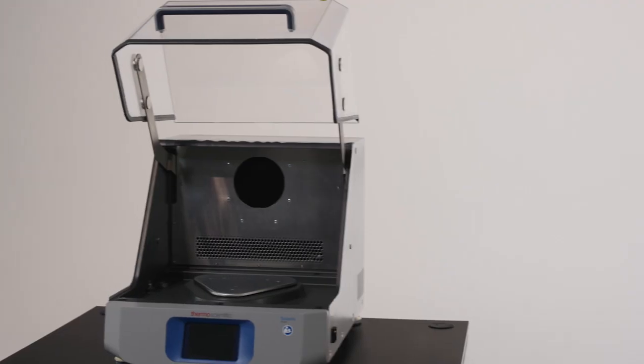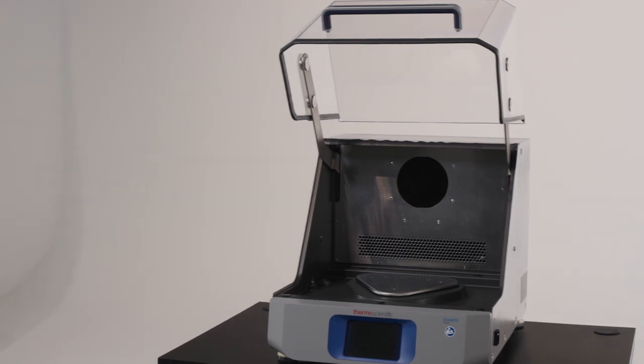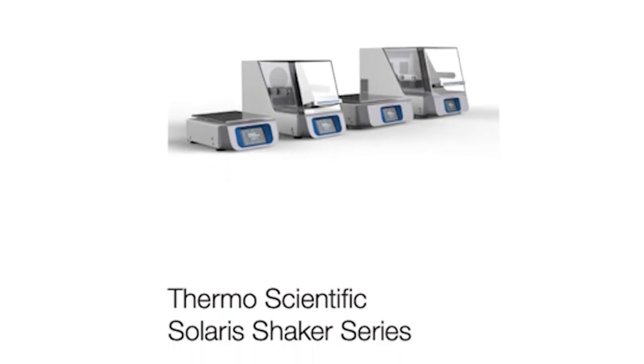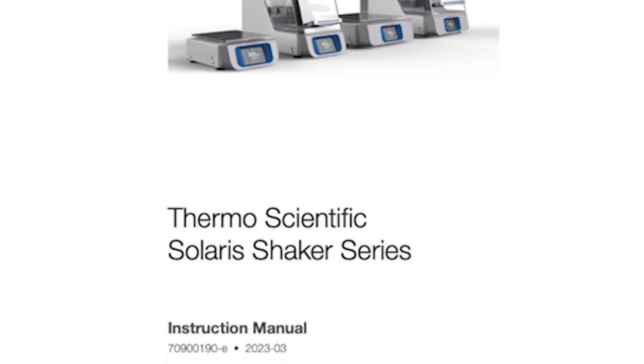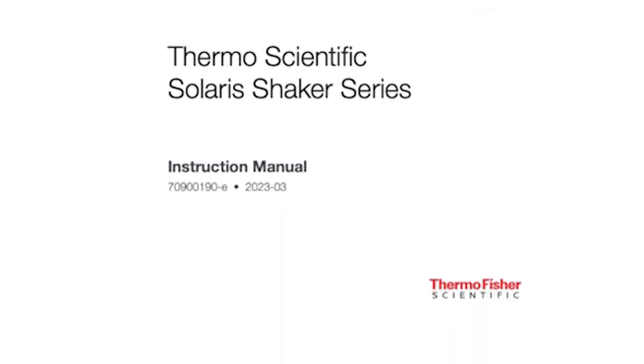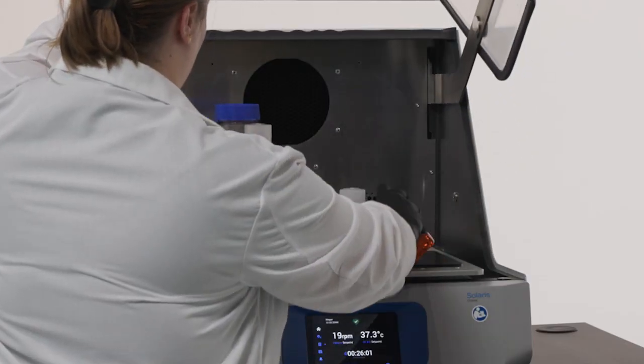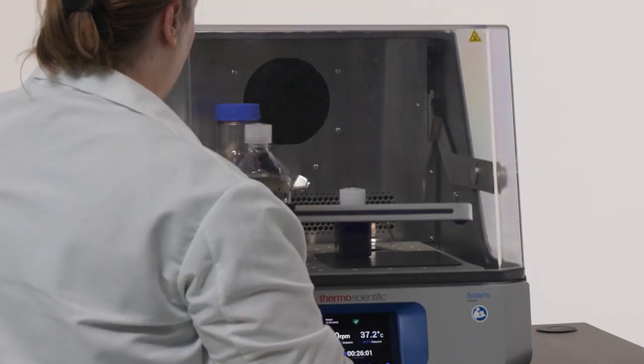The platform and some shaker clamps can be autoclaved at 121 degrees Celsius for 20 minutes. To confirm compatibility, please review the Solaris benchtop shaker owner's manual or connect with our sales support team. The Solaris shaking mechanism blends consistent performance with a heavy-duty, triple eccentric, maintenance-free design that's protected by a 10-year warranty.